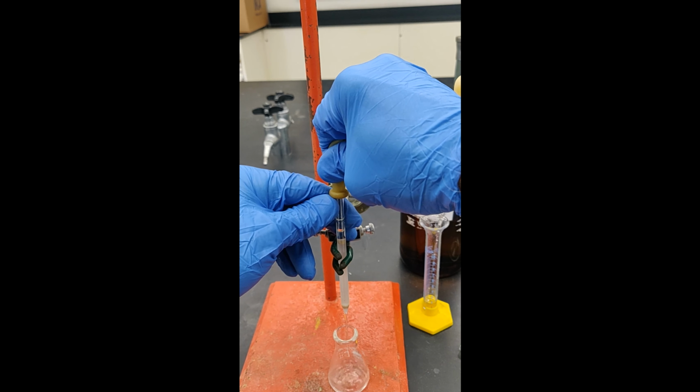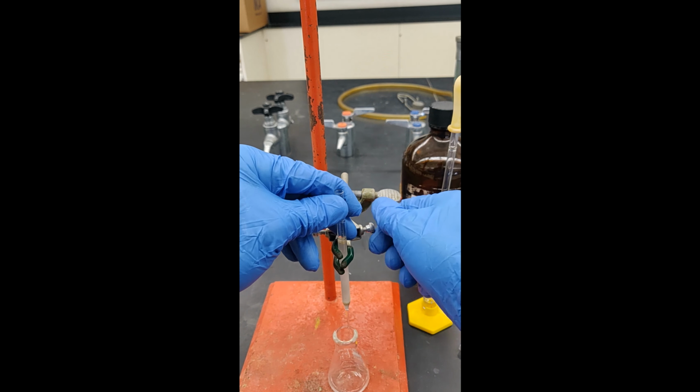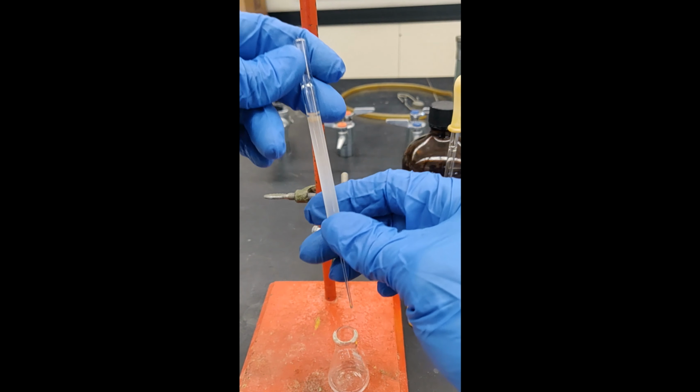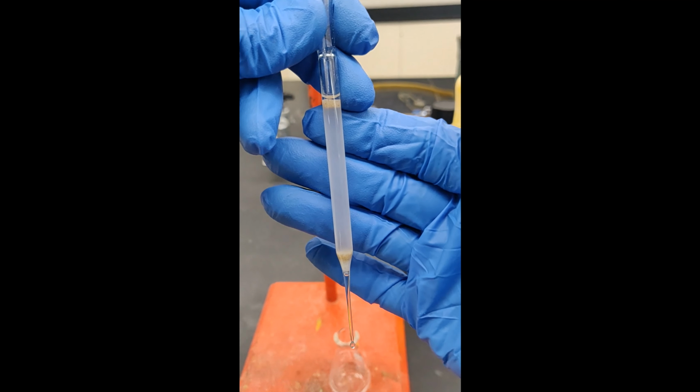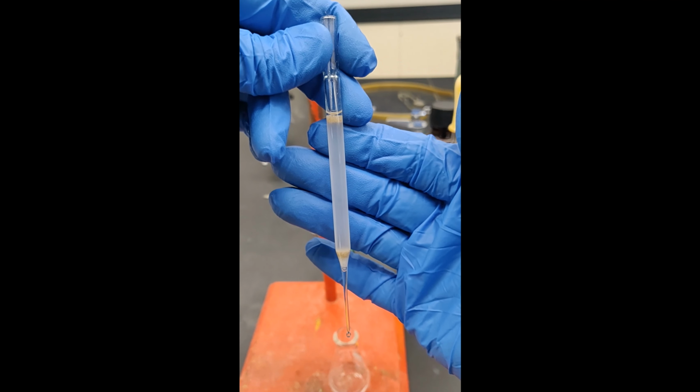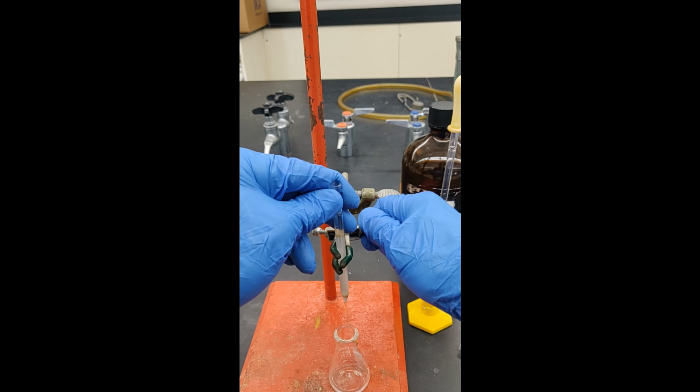Once the column is packed, be sure there is always enough solvent in the column to cover the packing, and as you proceed, never let the column go dry. Add more solvent as needed. The column is now ready to be loaded with the pigment extract.